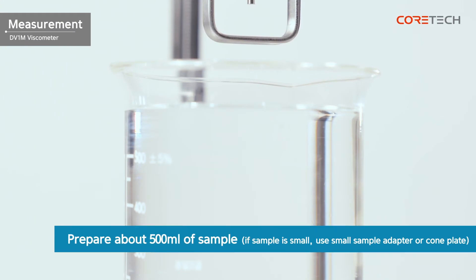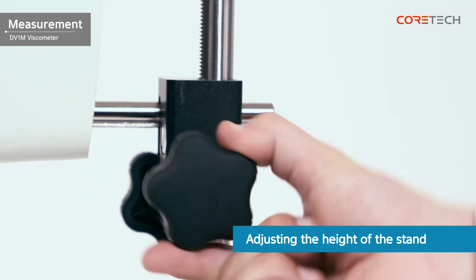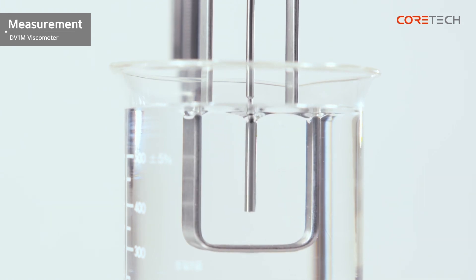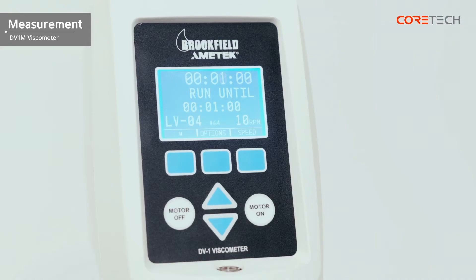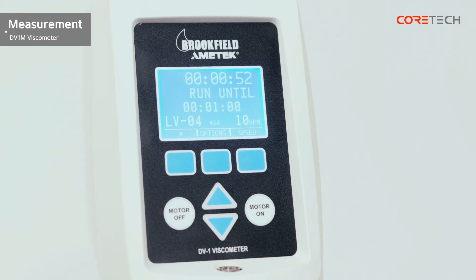Prepare approximately 500 milliliters of sample for measurement. If it is difficult to obtain a 500 mL sample, you can use Brookfield accessories such as a small sample adapter or cone plate. Turn the height adjustment knob on the right side of the stand to immerse the spindle in the sample up to the groove shown on each spindle. Then press the Motor On button located in the lower right corner. The display shows measurement time, measurement value, temperature, setting time, torque, spindle number, and RPM respectively. After the set time, the measurement ends and you can see the measurement results.